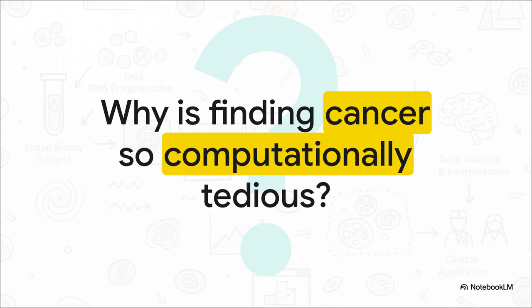Why is finding cancer in a simple blood draw still so computationally frustrating? I mean, the clinical promise of liquid biopsies is incredible. Just draw some blood, sequence it, and catch cancer early. But the computational reality? It's a vast landscape of incredibly messy, noisy data.